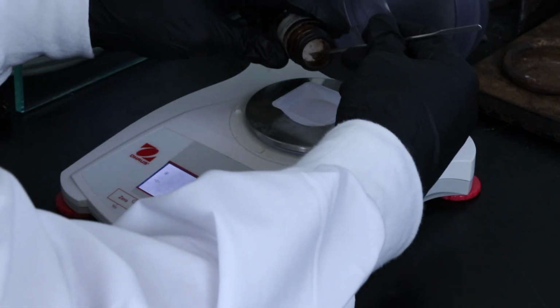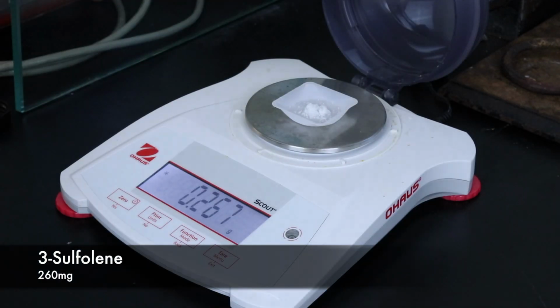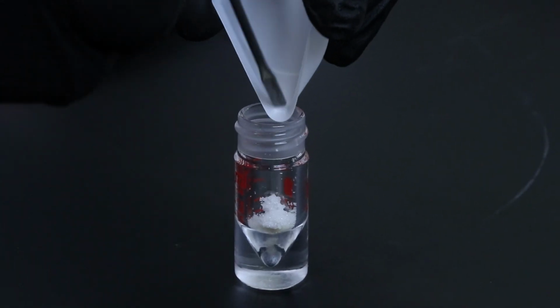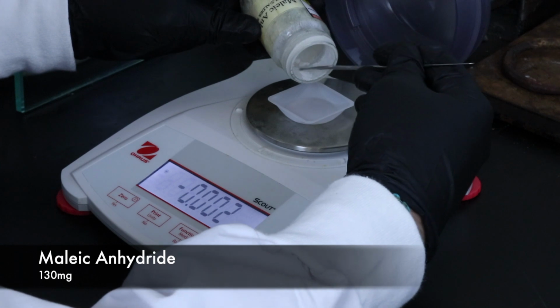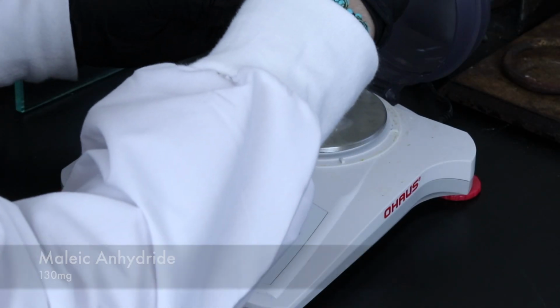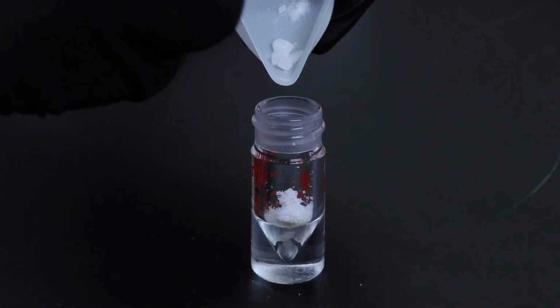I'll start by adding all of the reagents. So I'll measure about 260 milligrams of 3-sulfolene and add that to a 3 milliliter conical vial with a large spin vane. Then I can weigh out 130 milligrams of the maleic anhydride, which was a little clumpy, so it was kind of hard to get out, but I eventually got there. And then I can add that to the conical vial as well.